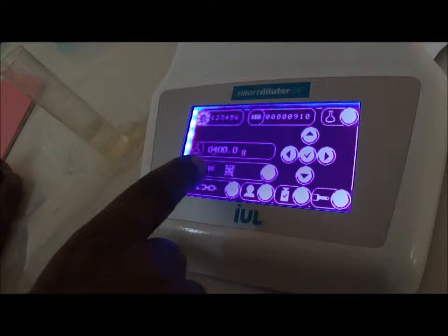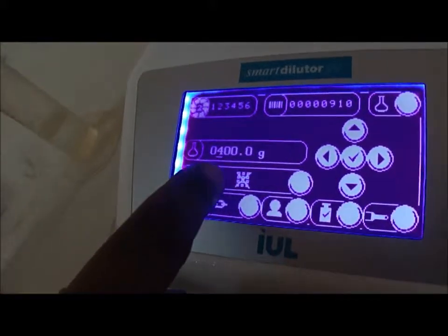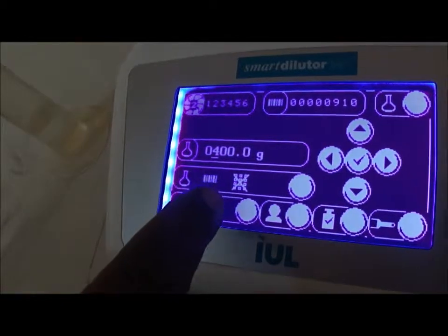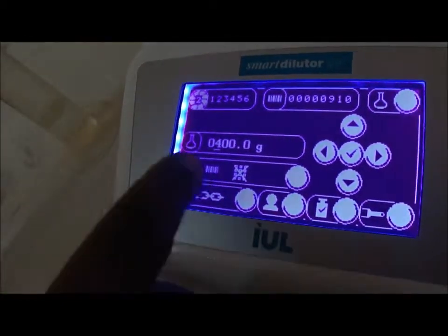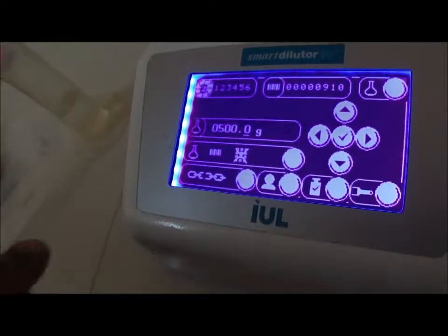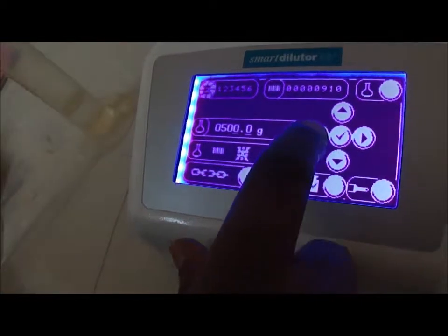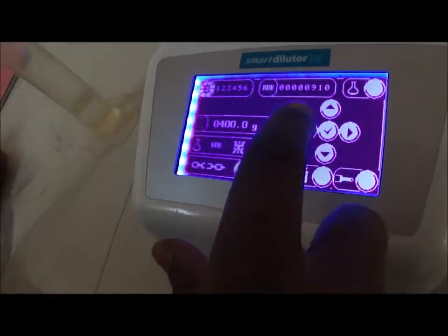Now, you see here that the ID of the sample is crossed. If I press this disk, it will be uncrossed. Let's validate first this one. Not 500, 400. I take here 400 and then I validate.